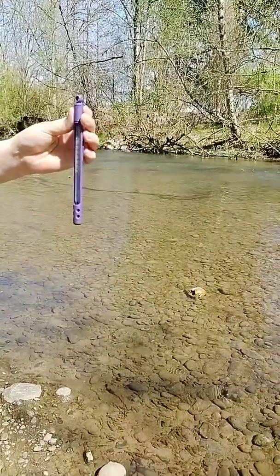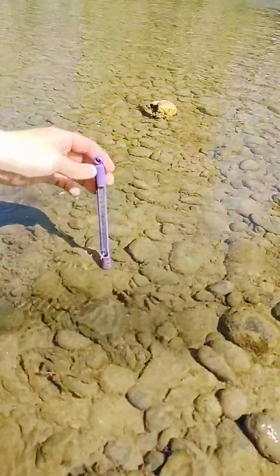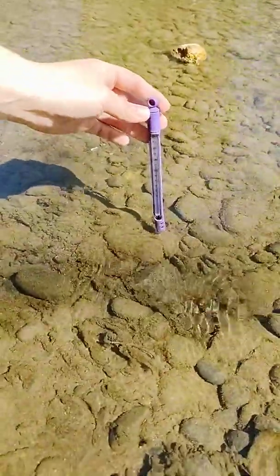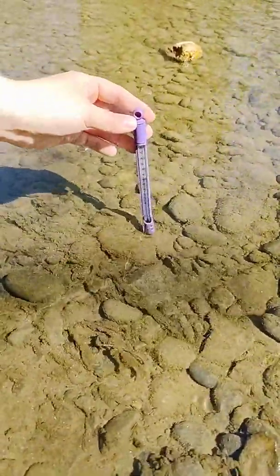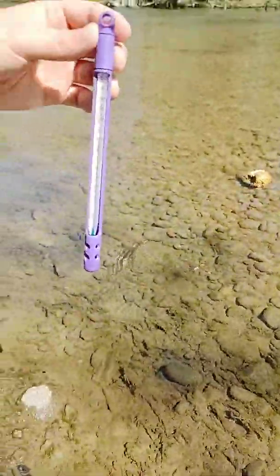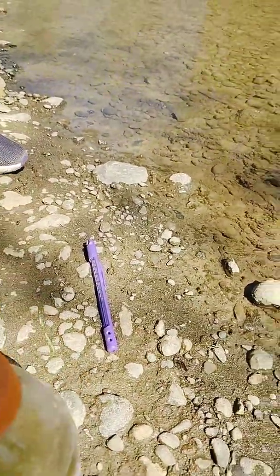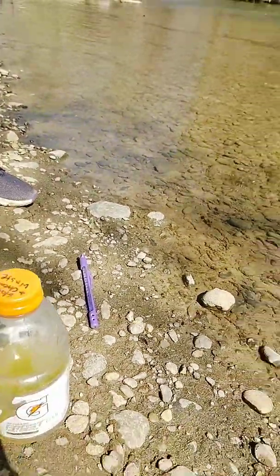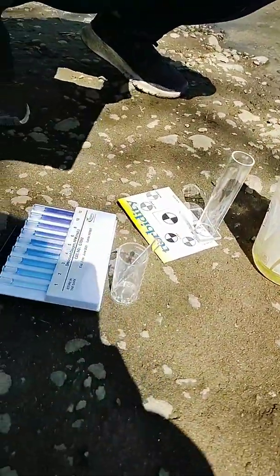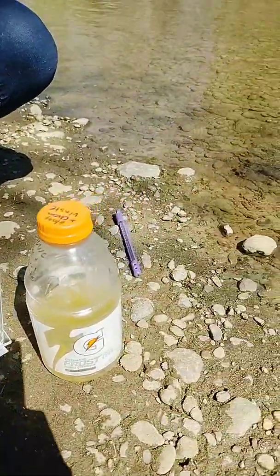To do this test, it's fairly simple. You're going to take this probe and put it in the creek here. You want to cover up those little dots at the bottom, so that it's fully covered with water. Typically you'll leave this in for about a minute, maybe 2 minutes. I already did this test earlier, so we don't have to wait. The temperature that I got was 14 degrees Celsius, which is about 57 degrees Fahrenheit. So that's our temperature for this reach of Johnson Creek, and we're going to talk about results a little bit later.